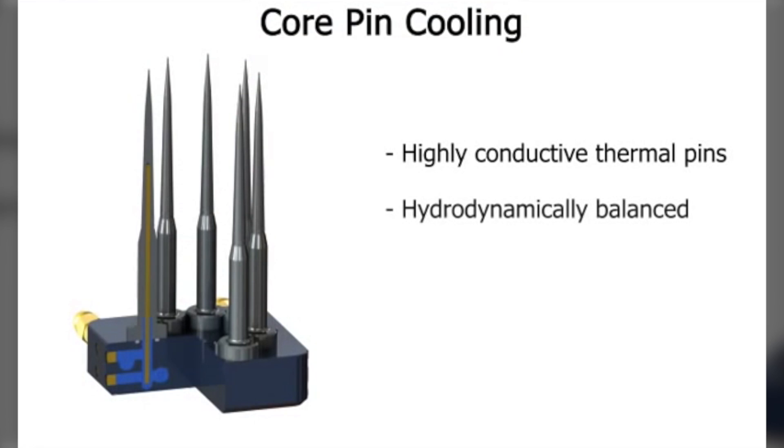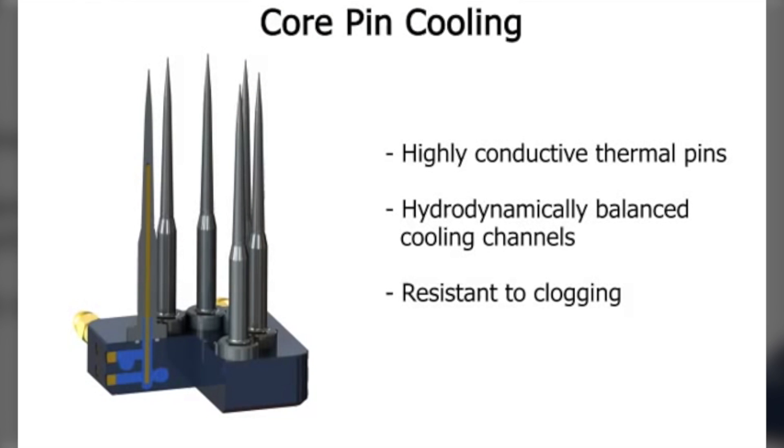Core pin cooling has also been addressed with the use of thermal pins inserted into the core pins. This avoids the issue of plugged cooling circuits in the core pins, which then overheat and cause quality issues. The bases of the thermal pins are generously bathed in a large balanced cooling channel that is extremely resistant to clogging.